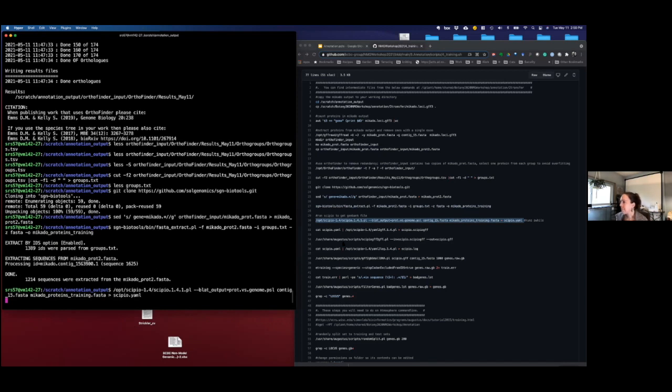So once this finishes, this is basically taking your protein. So this is gonna be your training set. That's what we just got from up here, from the FASTA extract tool. Those are some pretty high quality gene models that we're reasonably sure are mostly correct. There's always going to be some problems, but they don't have to be perfect to be training sets. You want them to be as good as they can be, but nothing's ever going to be perfect.